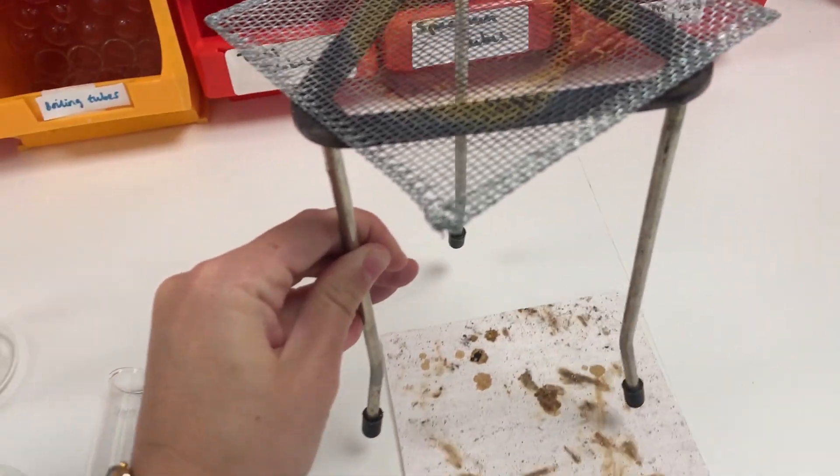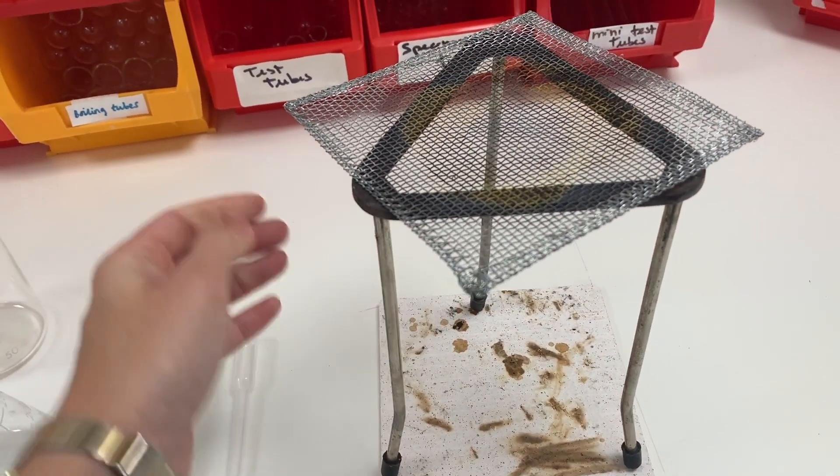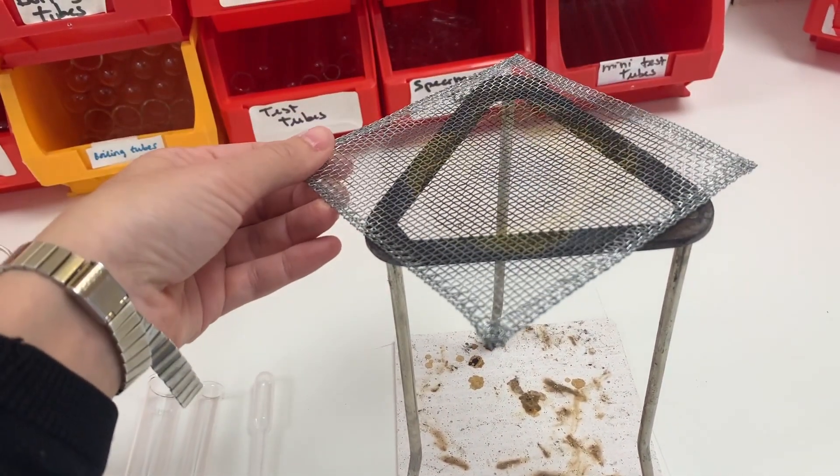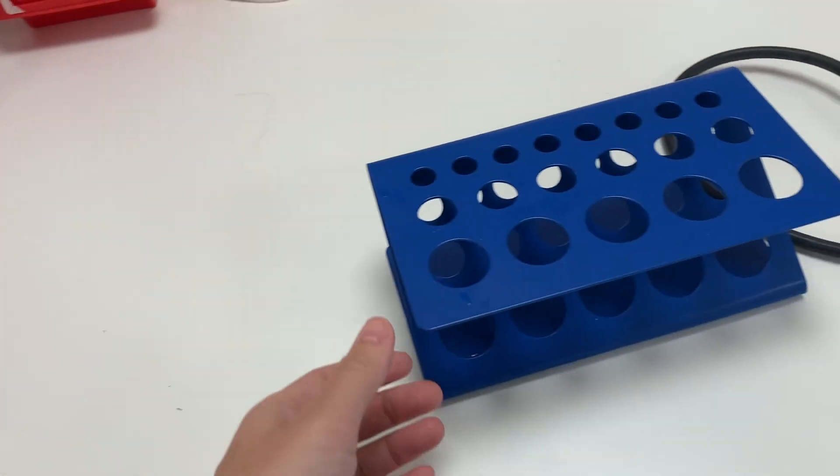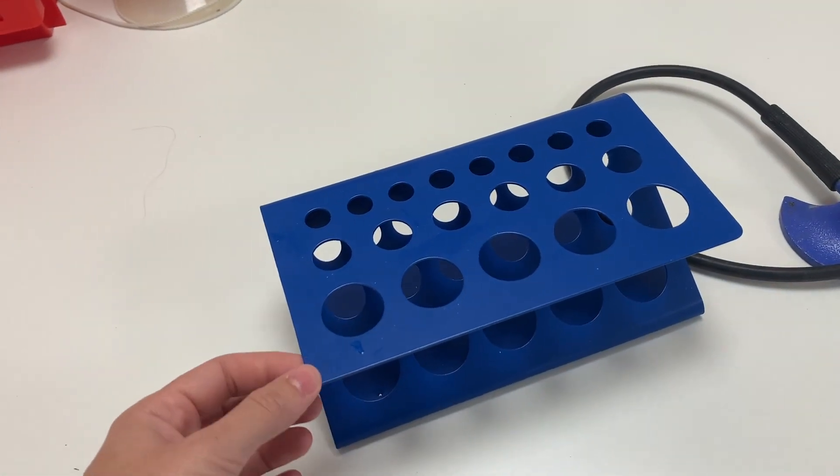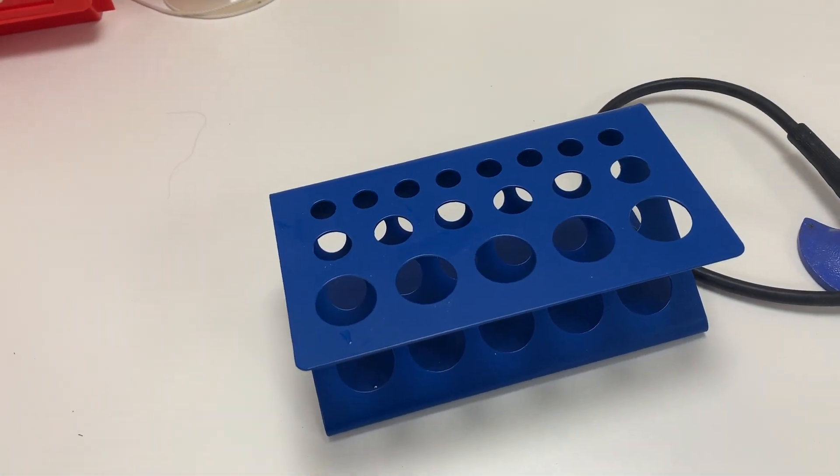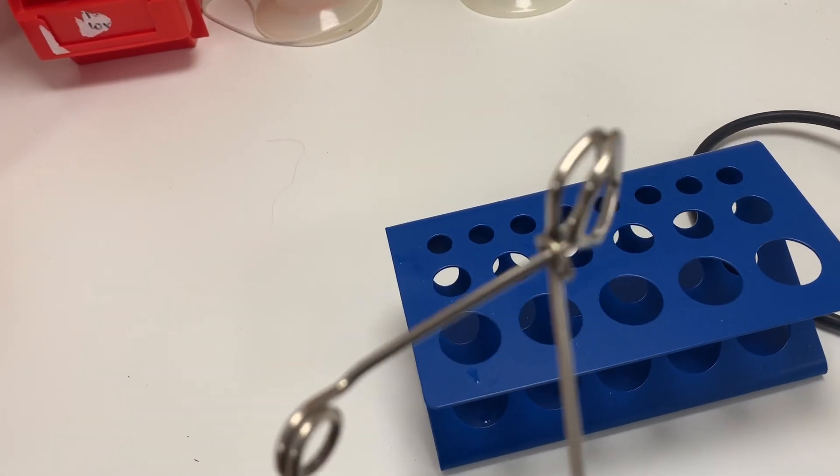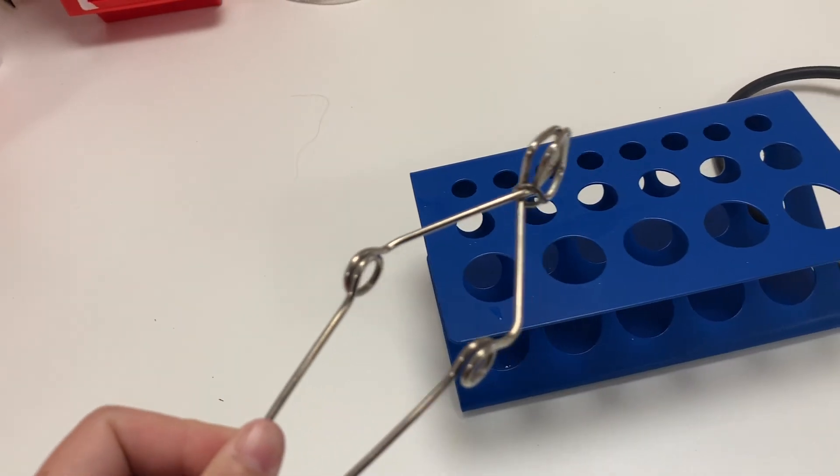This is simply a test tube rack used to arrange your test tubes correctly, and then you often need to pick up your test tube using the test tube holder.